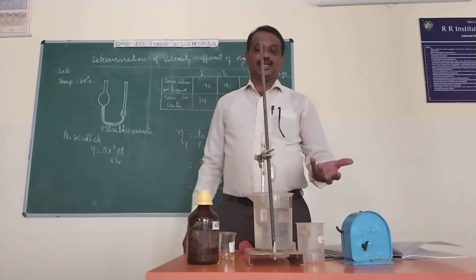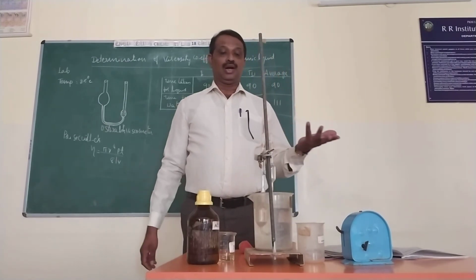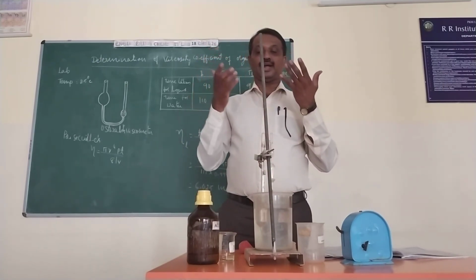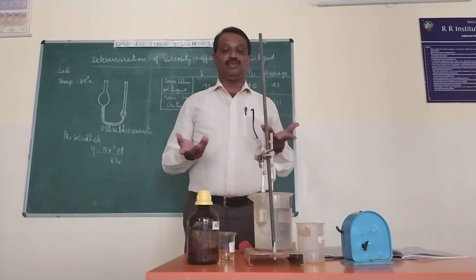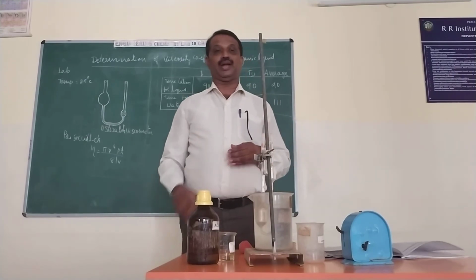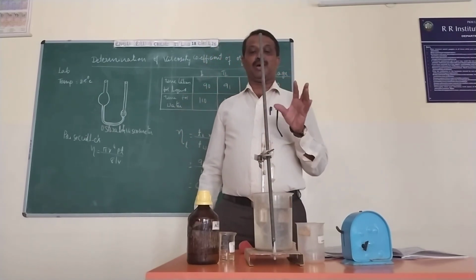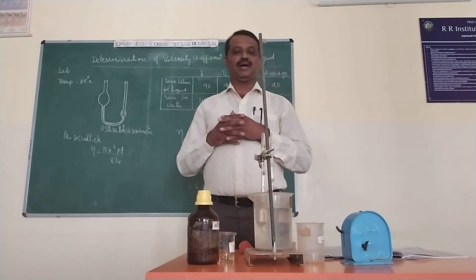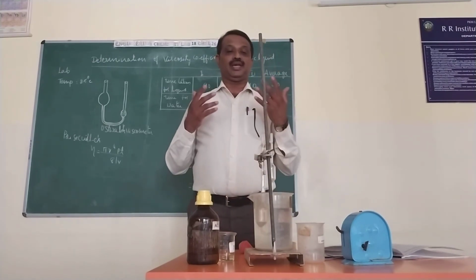If it is neglected, the time varies; of course, if temperature is varied, the viscosity is varied too. Increasing the temperature decreases the viscosity coefficient; it is inversely proportional. So from one liquid to another, how does it vary? If the thicker branched molecules are more, it automatically becomes thicker, with more molecular weight, more equivalent weight, and the temperature is varied.